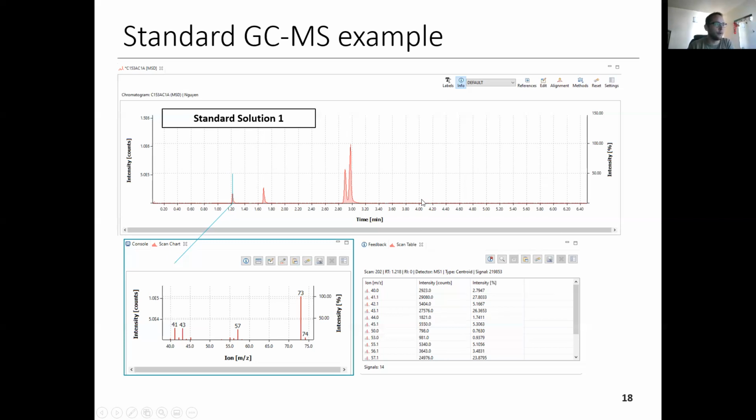And then when we're actually extracting the data to make our calibration curves, what you do is you'll select the entirety of this peak. So you'll select all the scans that make up that peak, with some baseline saying, below a certain threshold, we don't want any more. And then you integrate that and count all of the charges that are in there to get the total peak area.